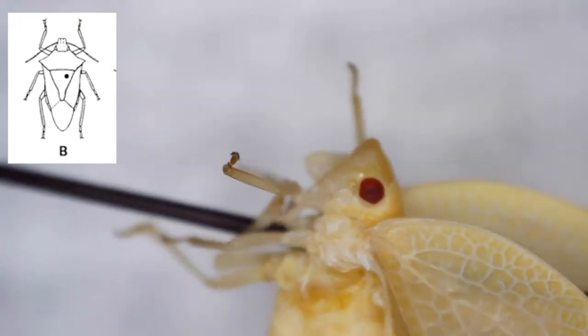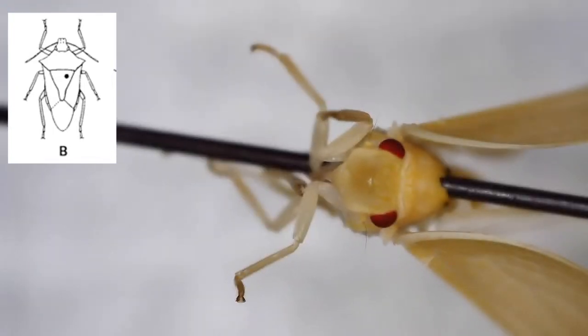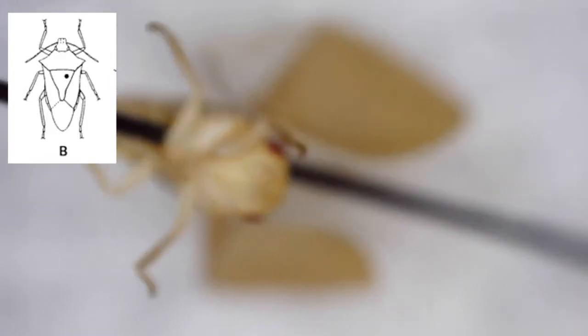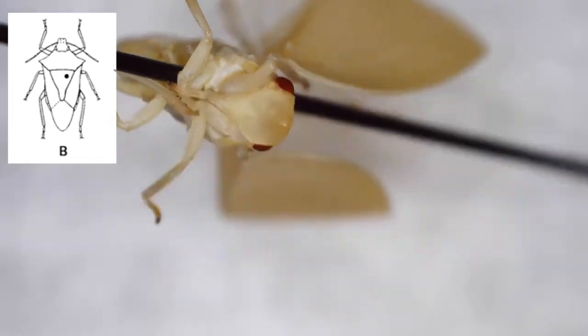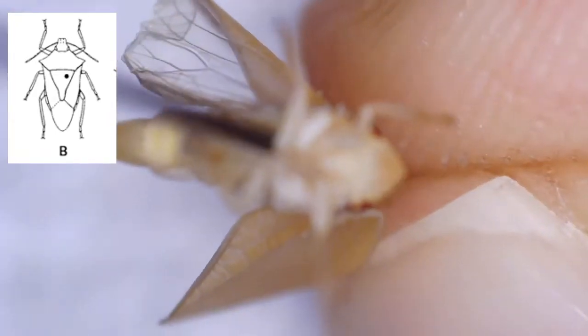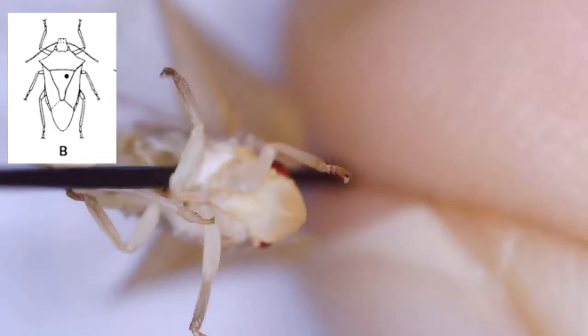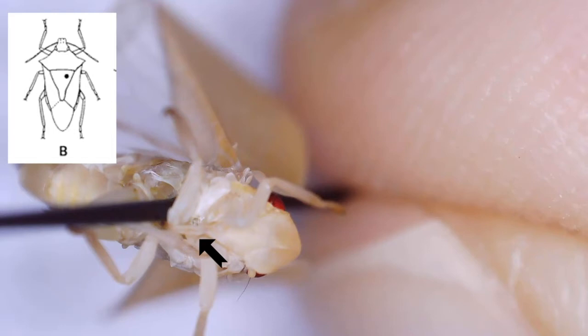What I'm trying to get here is a clear image of those tiny little hair-like antennae and also of the piercing, sucking mouth parts. That's what actually defines this order: instead of chewing mouth parts, they have piercing, sucking mouth parts that I'm trying to get into focus and hopefully point out to you here.